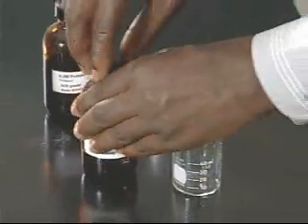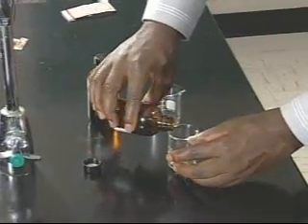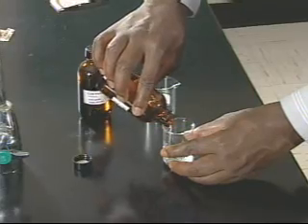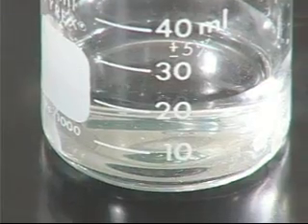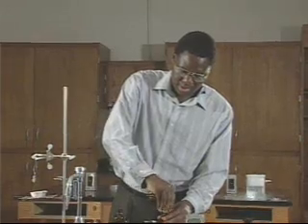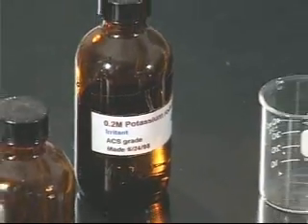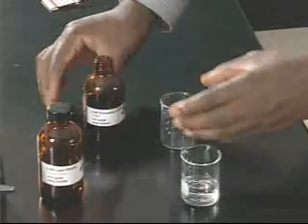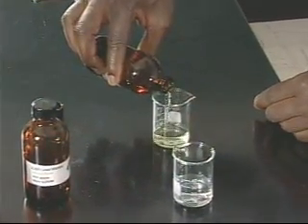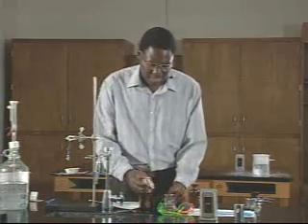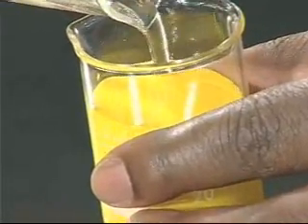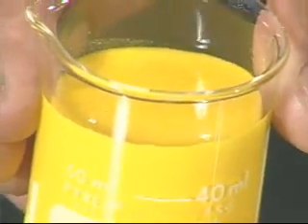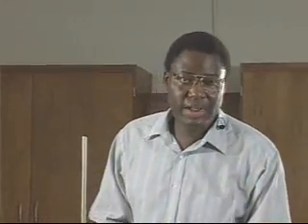How do we know that a chemical reaction is taking place? There are several things we can look for. One is a change in color or the formation of a solid, which we call a precipitate. Here I have two clear, colorless solutions — I'm pouring one in and mixing them together. We notice two things: a solid has formed, and there is a color change. Both are evidence that a chemical reaction has taken place.